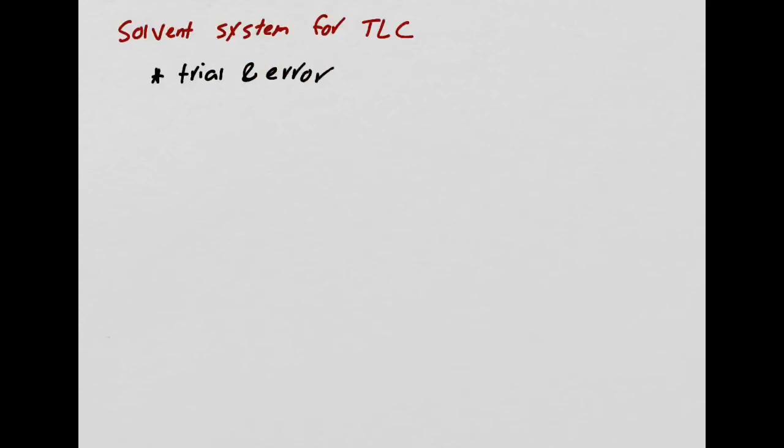Now, what would be considered a good solvent? A good solvent would give you nice RF values. Now, what do I mean by a nice RF value? A good RF value is usually between 0.25 and 0.35.